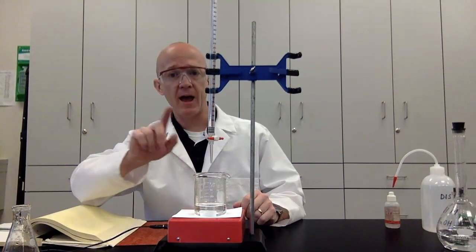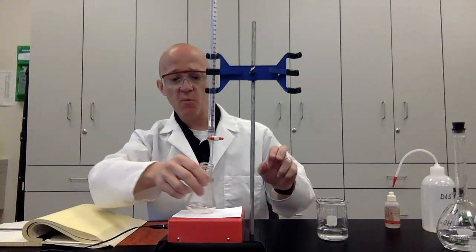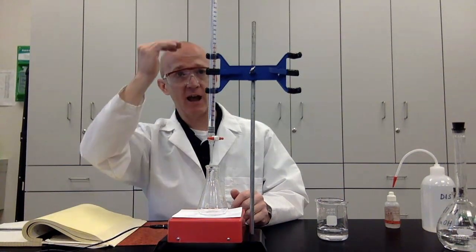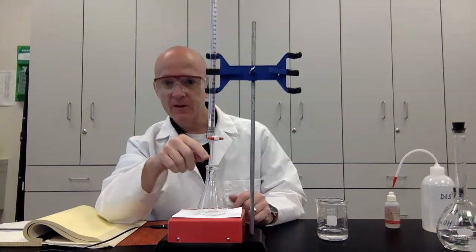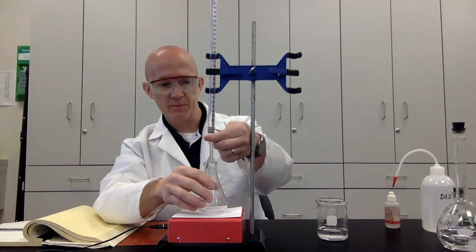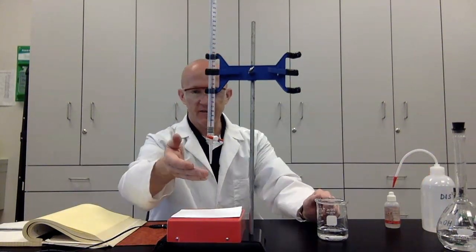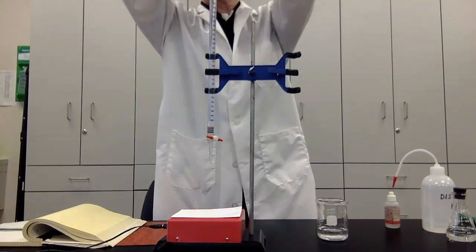Now one thing I do after I pour my known solution into my burette is that I'm going to open it so that I have no bubbles, because I want to know exactly how much volume I'm using. So if I don't have anything in this little nozzle here, that's going to give me a false volume. So let me go ahead and open this just a little bit, and I can just get rid of this, put this off to the side. Now that I've gotten my nozzle free from any bubbles, I'm going to top this off a little bit more so that I have plenty to use.